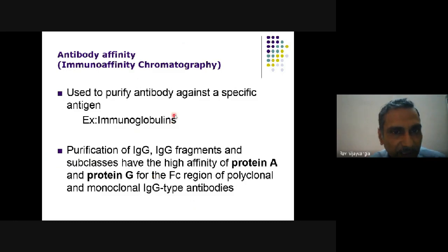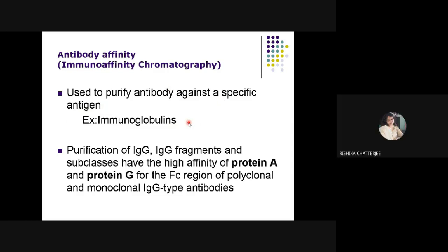Another example of affinity purification using natural affinity is purification of immunoglobulins. All of you know what immunoglobulins are? Yes, sir. Antibodies.